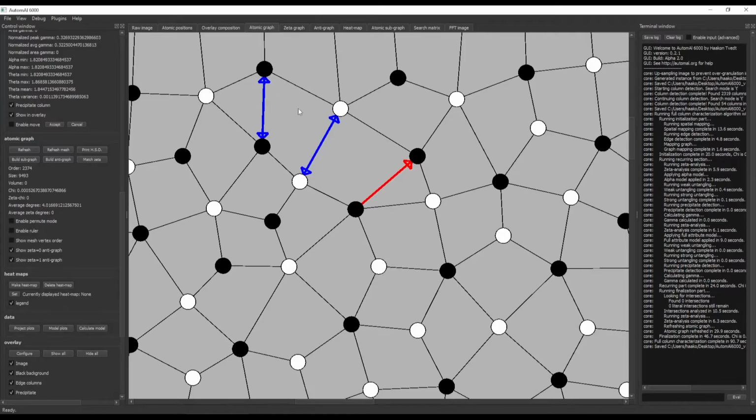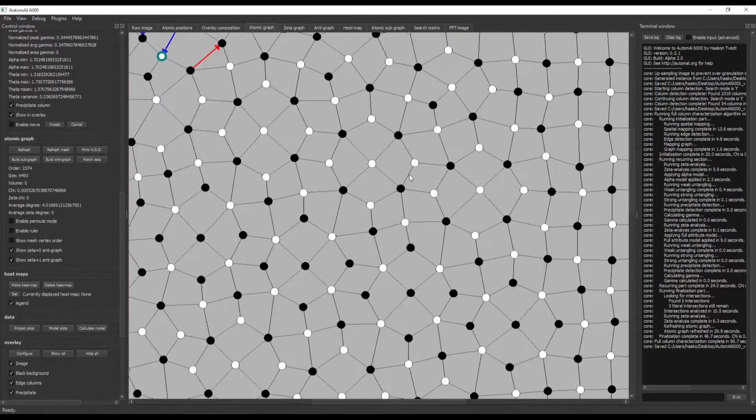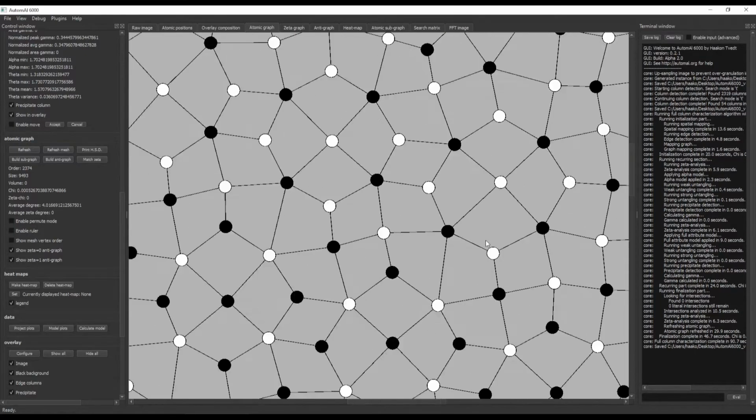By the way, blue lines mean that both of them agree that they are nearest neighbors, but they are of course on the same plane, so that should not occur. The thesis of this method or algorithm is that in areas where all the arcs are symmetric, like the area we are looking at now, you should not need to check it. This should be all correct.